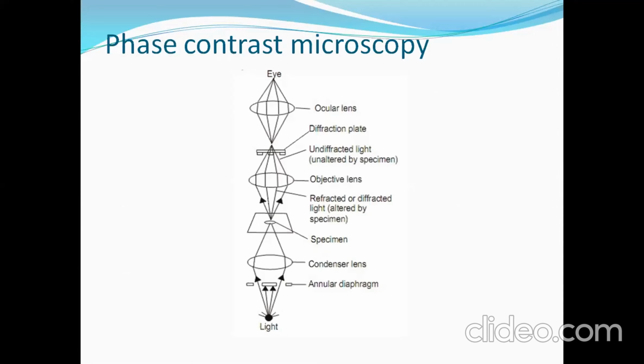So next we pass on to another very important type of light microscope. Oh, again, another thing I have to mention: the confocal microscope is to some extent a type of fluorescence microscope where a pinhole is used, right? So what is the function of the pinhole?